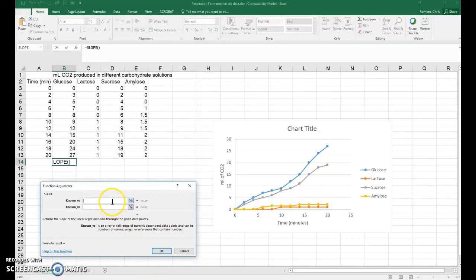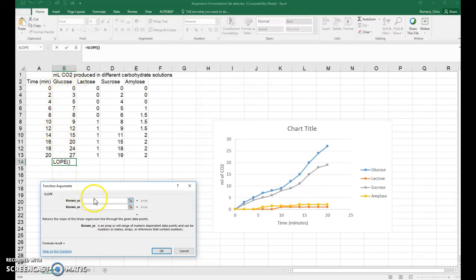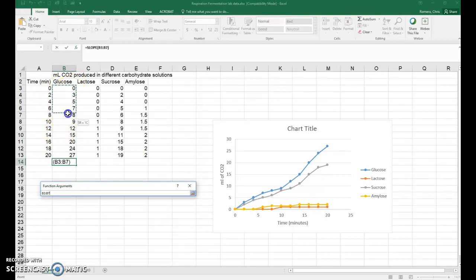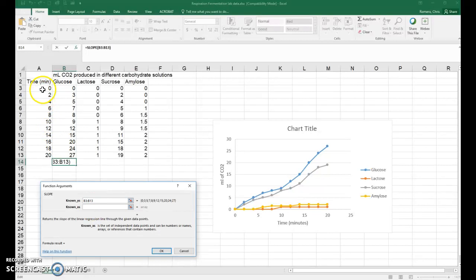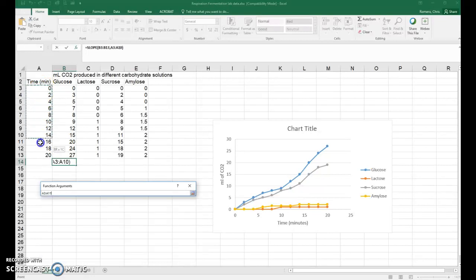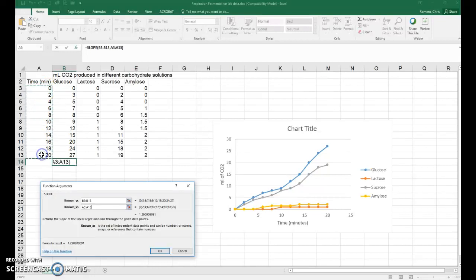So your instructor may ask you to calculate the rate for a different range of values. I'm just going to do it for the entire range of values for the set of data. So for our known Ys, we're going to select all of the CO2 data in the column. For the Xs, we'll select all of the time periods, so all the way to 20 minutes.